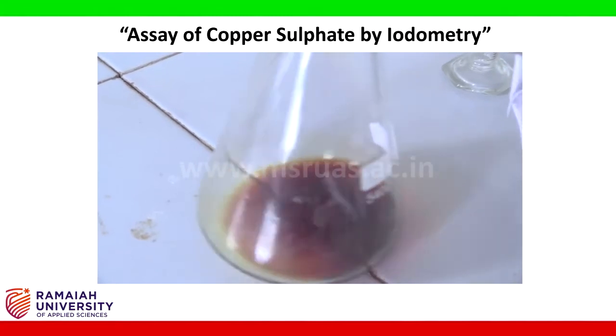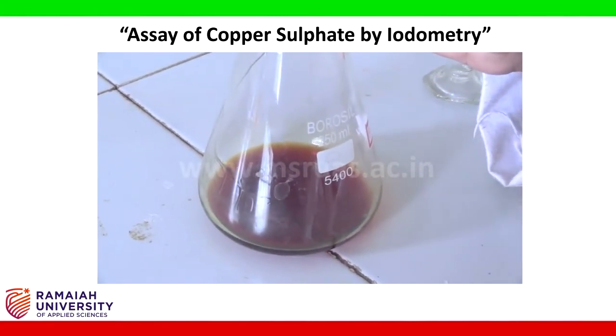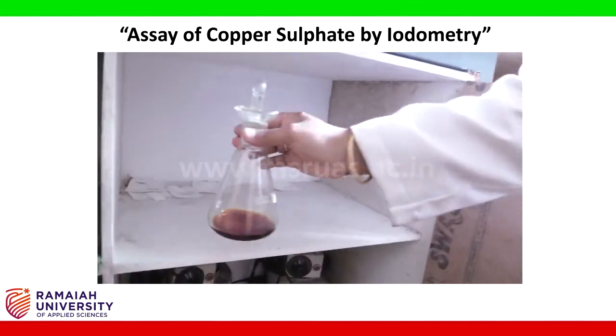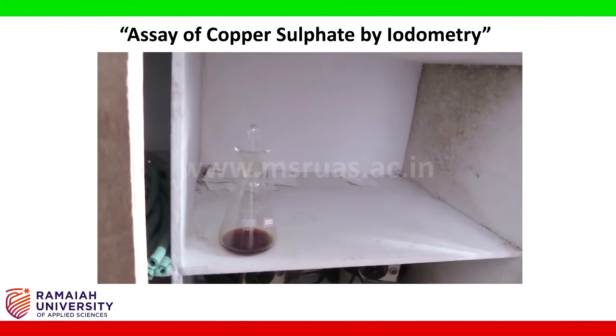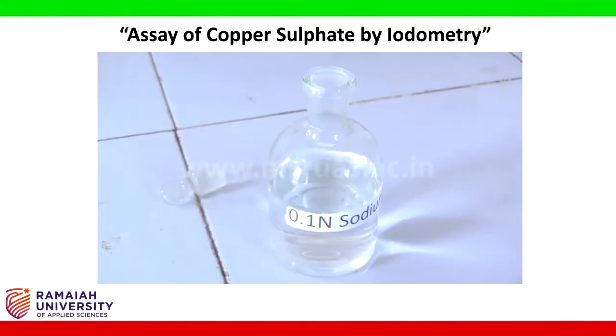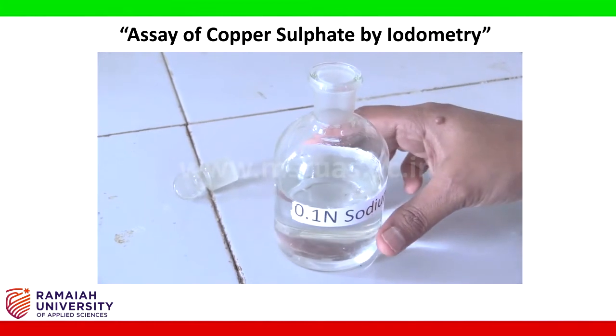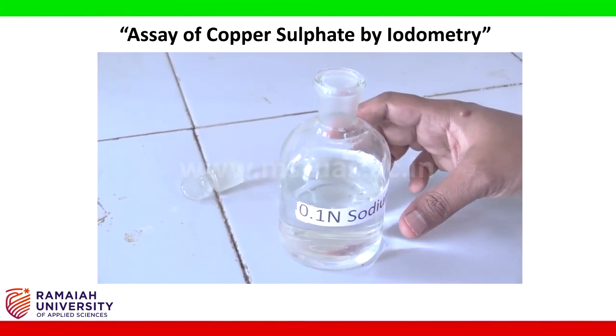Stir the solution and keep the iodine flask in dark for 15 minutes with occasional shaking. Meanwhile, rinse the burette with 0.1 N sodium thiosulphate and then fill the solution up to the mark.